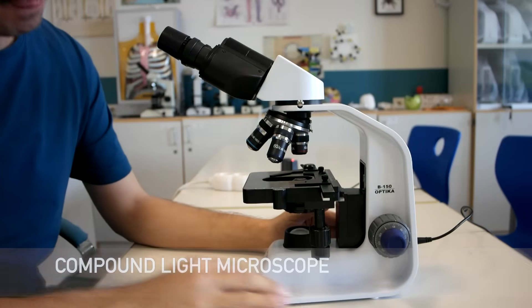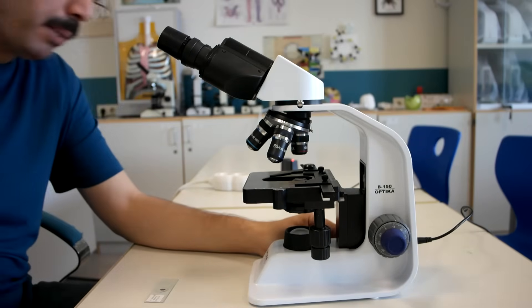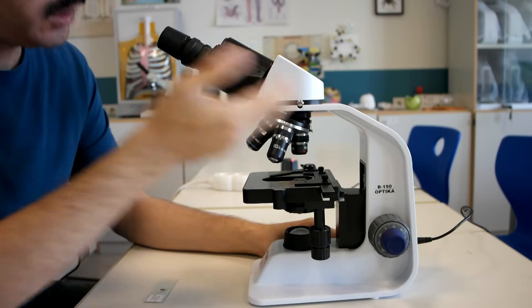This is a compound light microscope. We call it compound because light passes through two lenses, one here and one here.